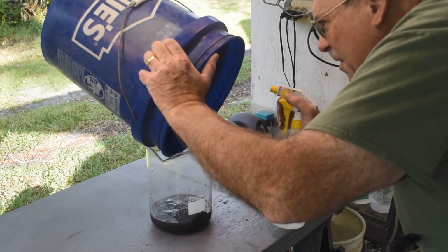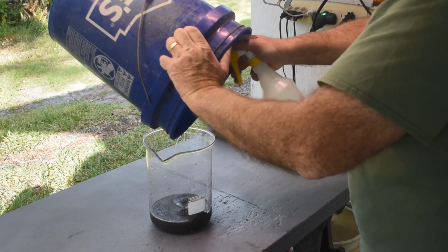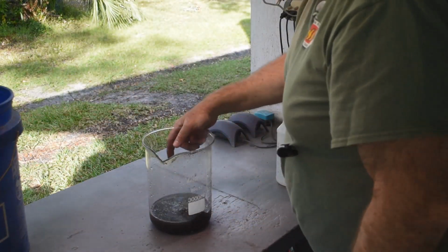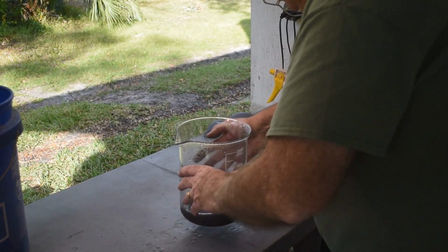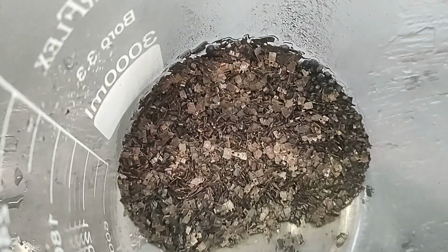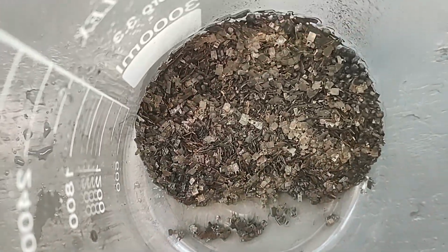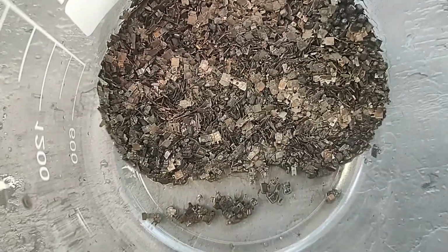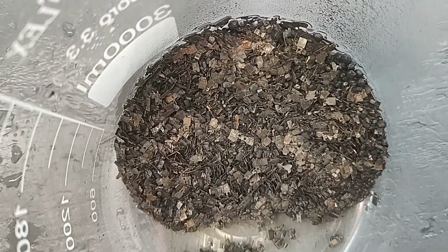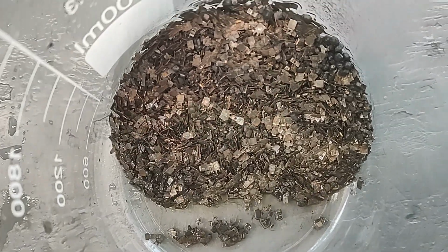That's a pretty clean bucket right there. Okay. Now it's a pretty clean bucket. Okay. So I'm going to rinse this with distilled water a couple times. And I'll give you a look at it before we move on. So here's a look at the stuff down in the bottom of the beaker. It's not as colorful on the video as it is to my eye. It looks really coppery. And last time I did this, I got a lot of copper out of this stuff. So, yeah, I can see the copper in there again, but we've gotten rid of a whole lot of other stuff there.